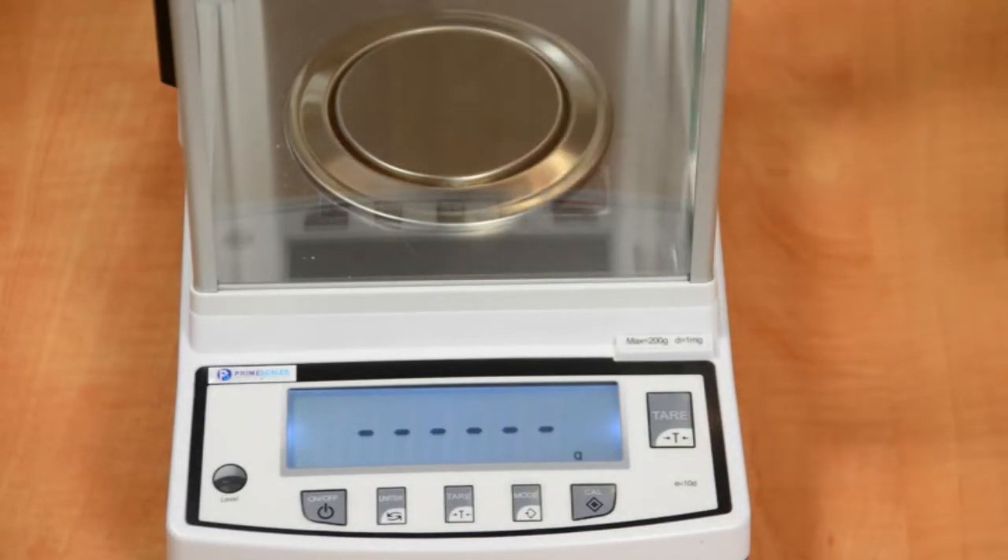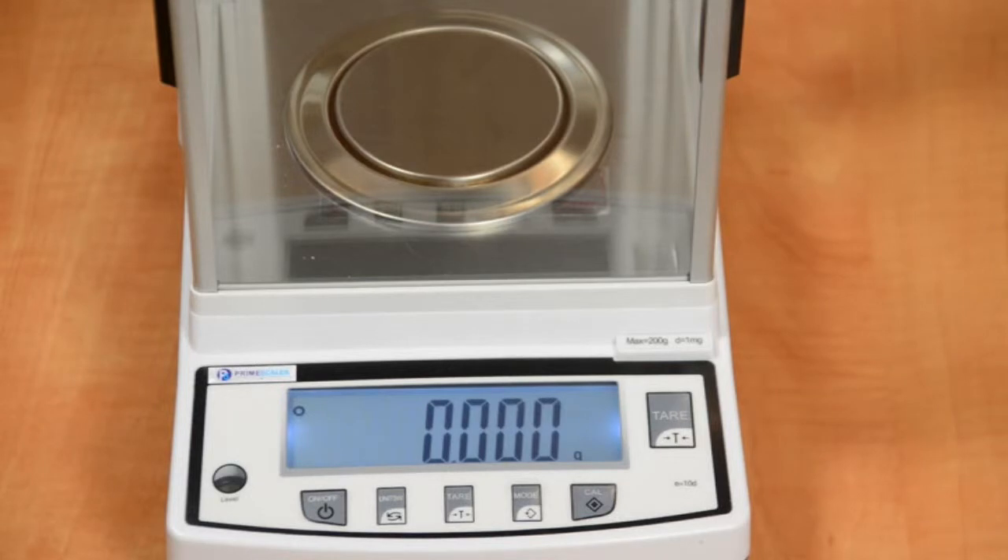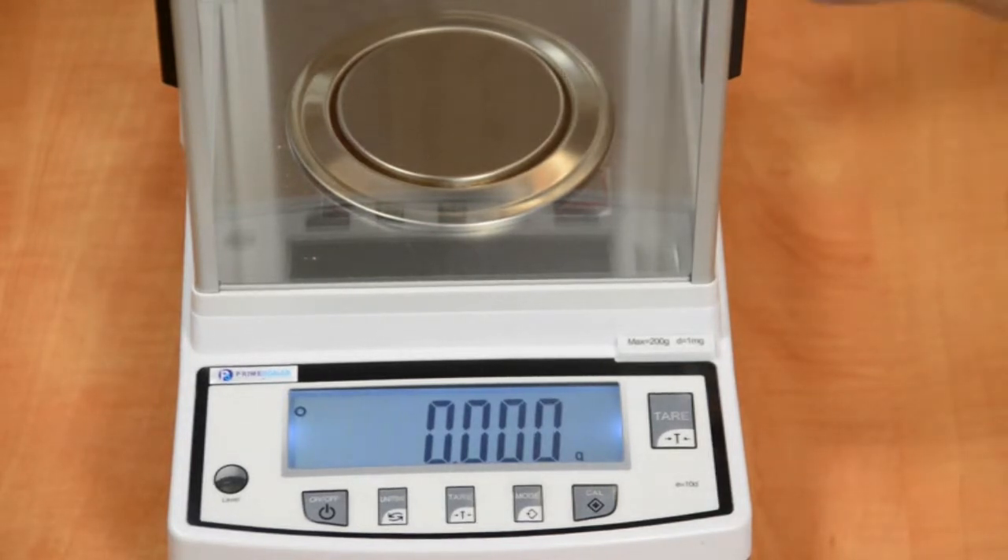Now we will do the decreasing test with F1 class calibration weights. We recommend you watch the entire video so you will see the great linearity of this scale.